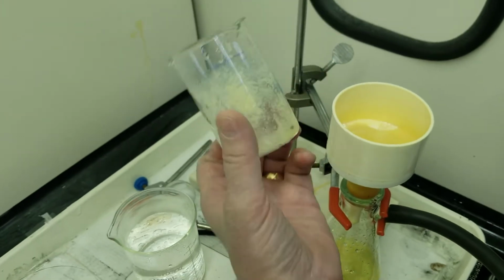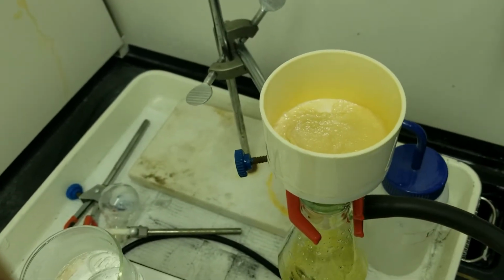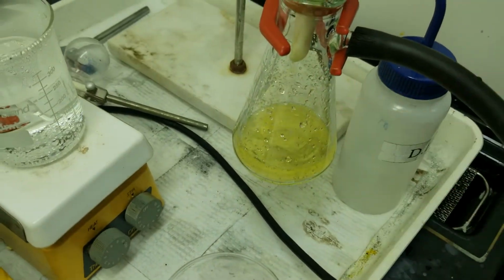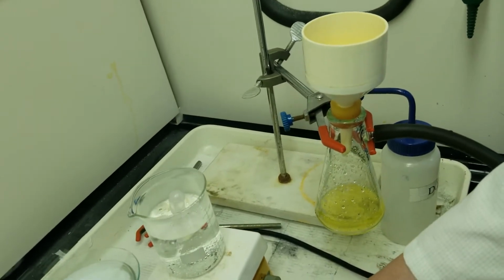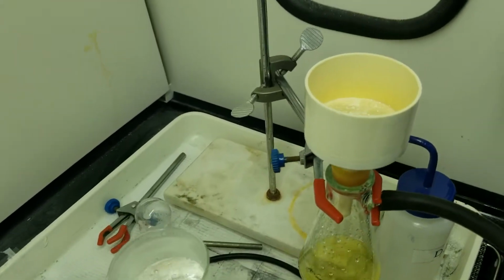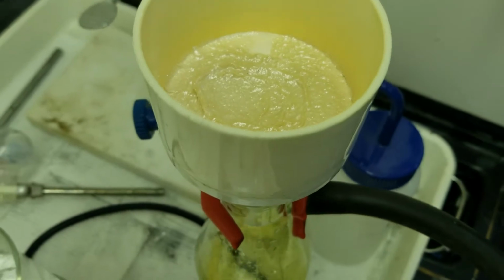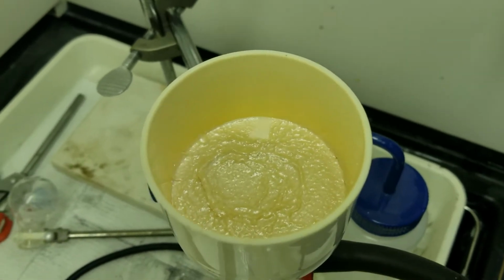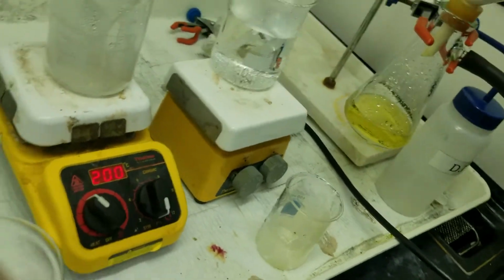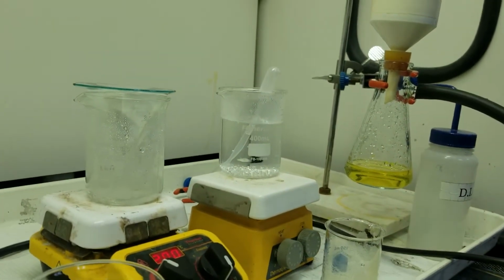Okay, so I rinse that one time with pure water. We're going to wait for the suction to stop dripping. See the dripping? As soon as it stops dripping, we're going to transfer it right back into the beaker, and then we're going to do our hot boiling step. So I'm going to set that up. It's still discolored. We still have to decolorize it. Yeah, so the decolorizing step is mandatory at this stage. Okay, that stopped dripping. Let's transfer.